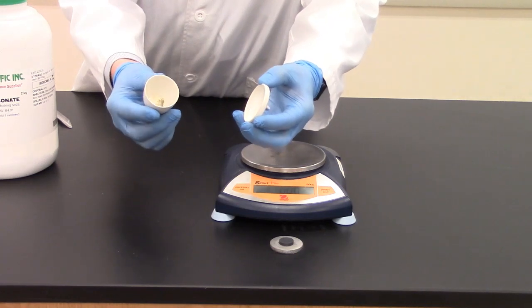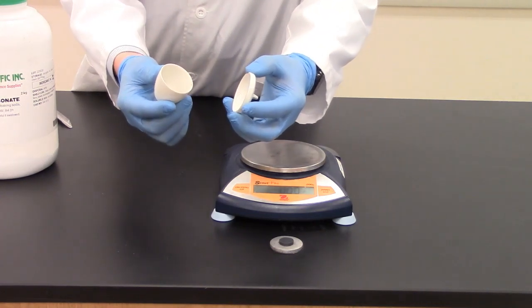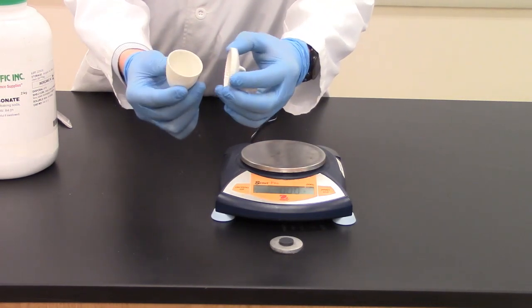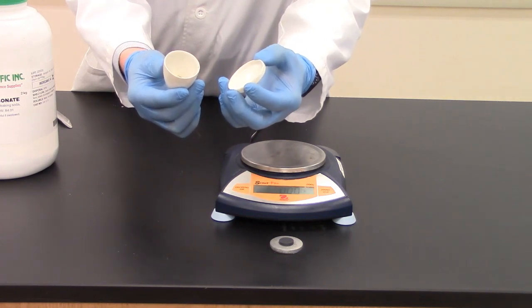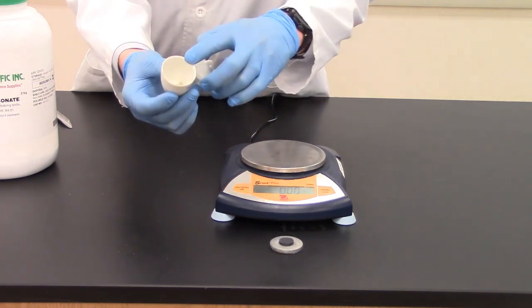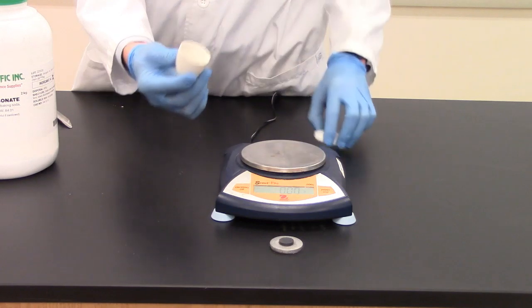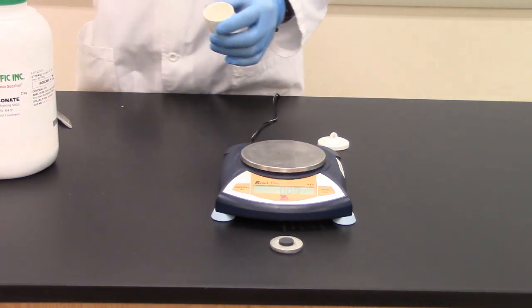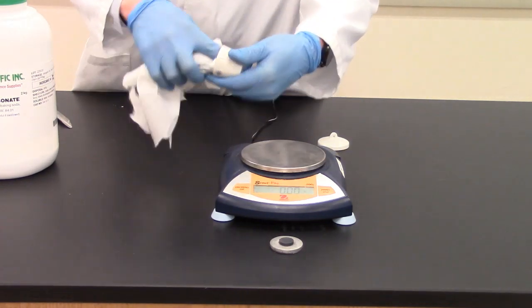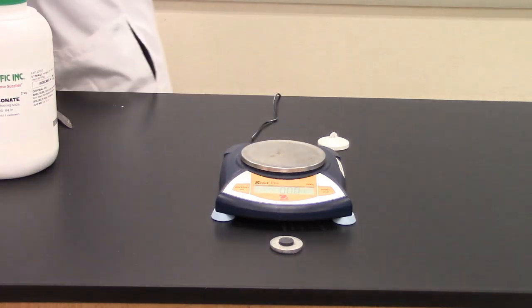So we're going to be working with a crucible. This is the container that we're going to be heating with the Bunsen burner. The crucible is a porcelain container to withstand high temperatures and what we want to do first is take a paper towel over the sink and wipe out any residue on the inside. So I'm going to go ahead and do that over the sink, get it as clean as possible.